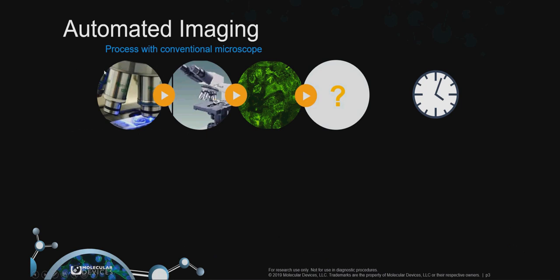So this is the typical way that many people are doing imaging. This is what I used to do myself, sitting at the microscope and focusing for your imaging assays. It can take a lot of time. I always like to tell a story. Basically, I feel like when I was a postdoc, I spent about 3 years in a dark room myself. So I know that this is very time intensive.